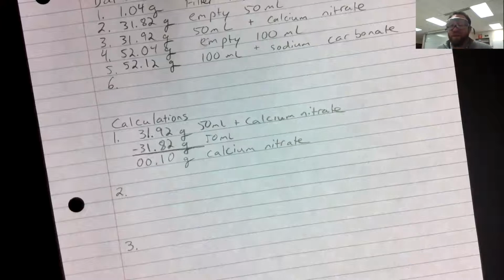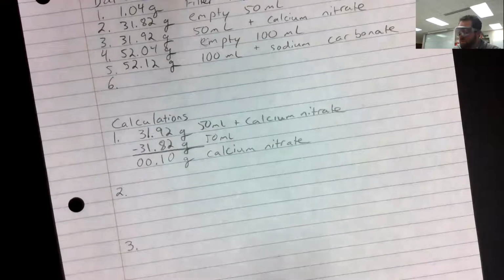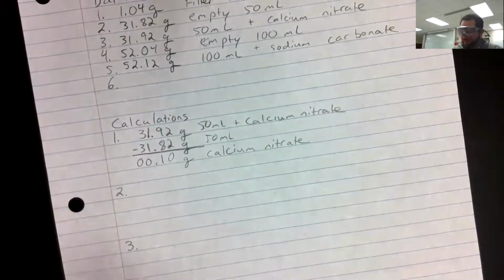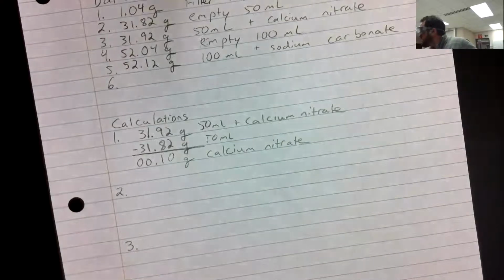Rewind the video and go back and look. We have a white powdery solid. Why is it white? Why is it powdery? That's because we have one solid product. That product is solid. So that's why you have to use your solubility table on the back of your periodic table to figure out which of our 2 products, only one of them of the 2 is going to be solid. Use the backside, determine your states of matter, write a balanced chemical equation, and that's step 3. Again, I'll give you guys a few minutes to work on that. I'll continue to filter and decant.